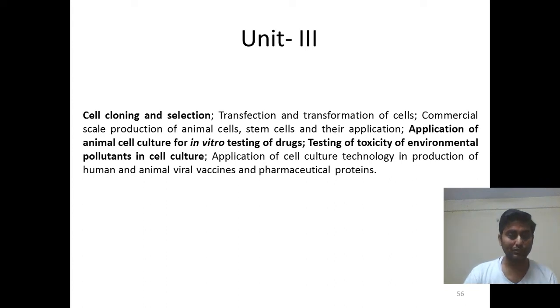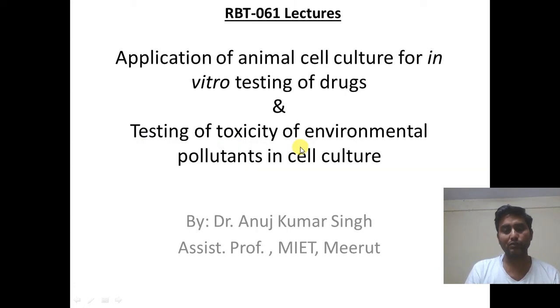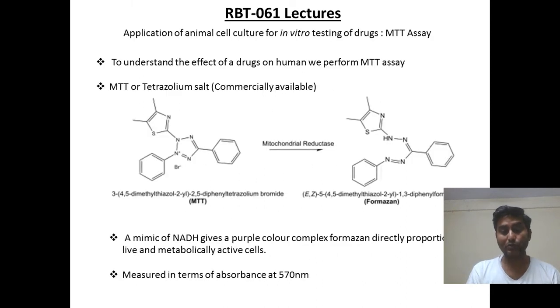We are going through this unit 3, and although we are covering some part of cell cloning and selection, today I am going to teach you about the application of animal cell culture for in vitro testing of drugs, and also testing of cytotoxicity of environmental pollutants in cell cultures. To do that, we should understand the MTT assay.